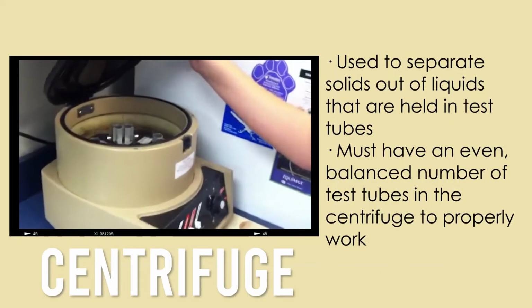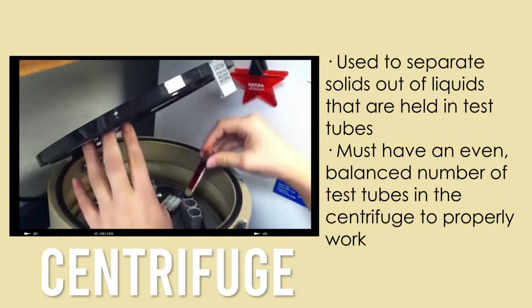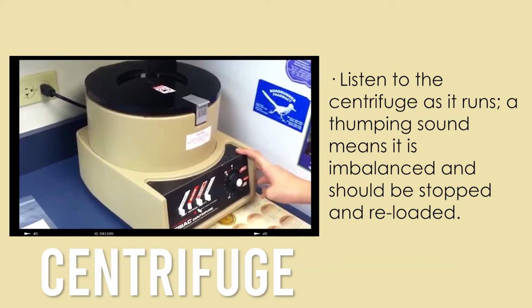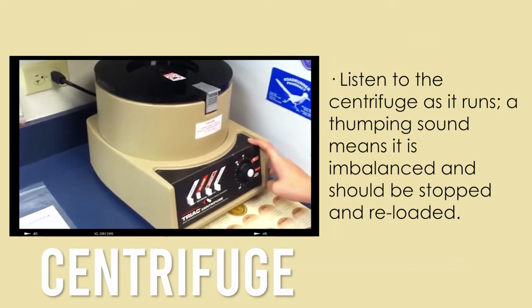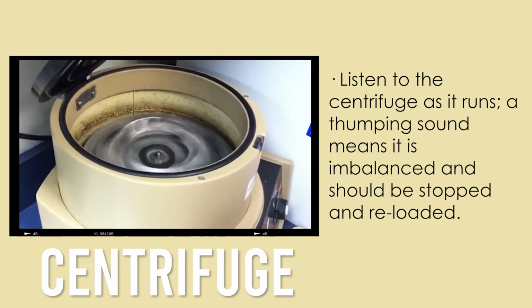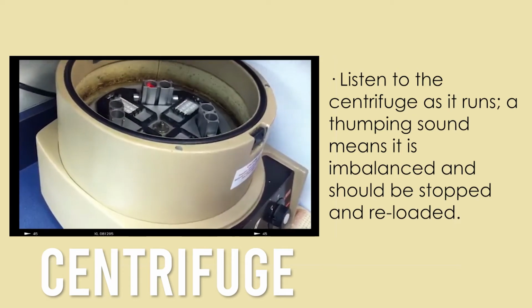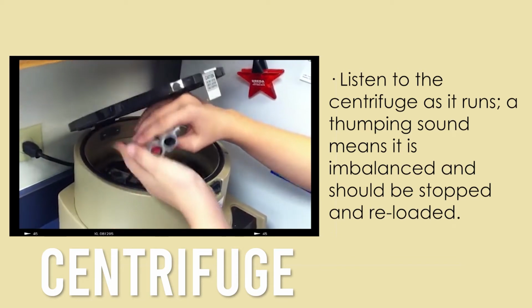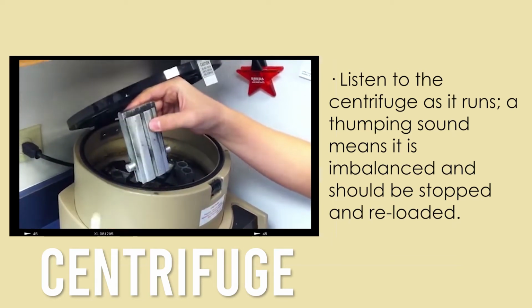It is used to separate solids out of liquids that are held in test tubes. Reminder that for the centrifuge to work properly, it must have an even, balanced number of test tubes, and listen to the centrifuge as it runs. A thumping sound means it is imbalanced and should be stopped and reloaded.